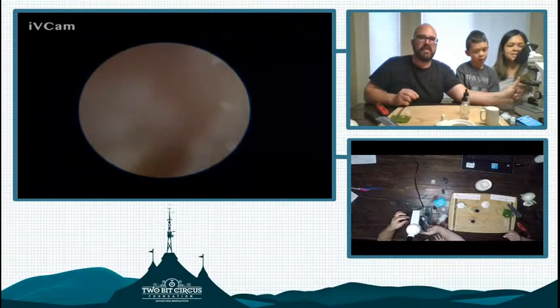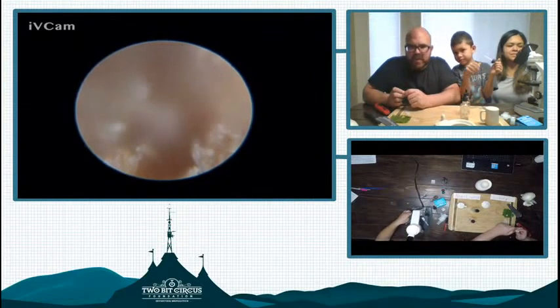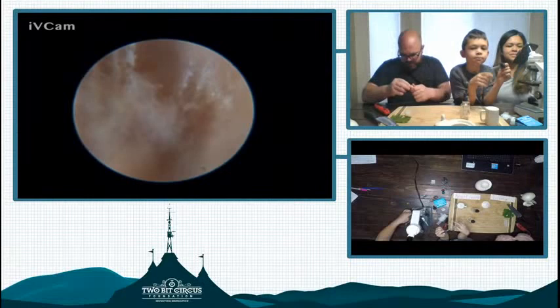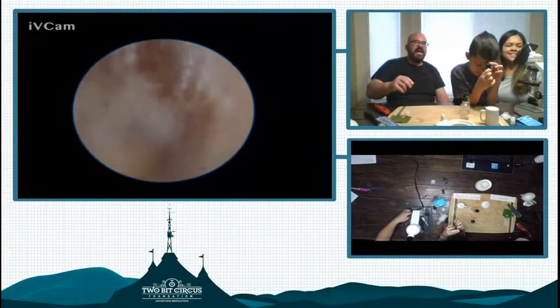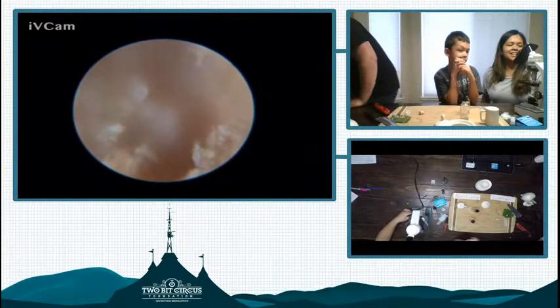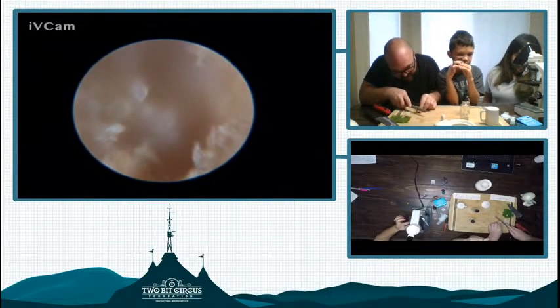Next to Mars. I wanted to get more light. Is that the diaphragm one? Cool. So we're adjusting the microscope now, trying to see if we could get focus onto the cork. And I don't think we're getting a really clear image here. We need a nicer, thinner cut piece. A smoother cut. Yes, it does have a space feel in there. Alright, let's see. Let's try to get a thinner layer.